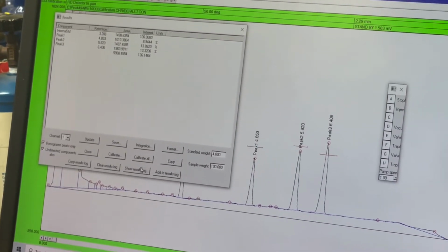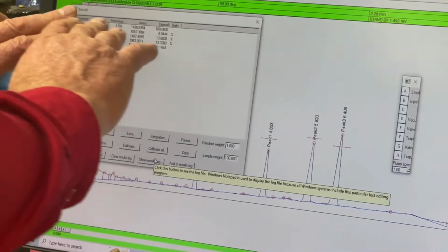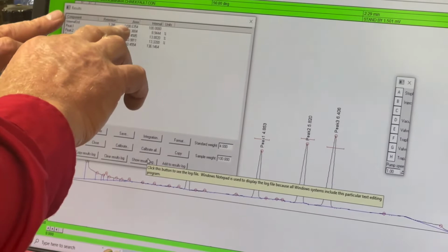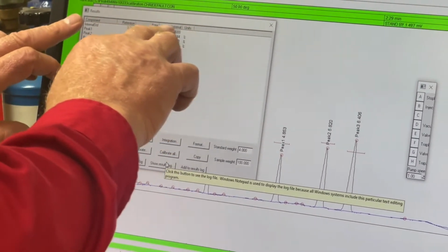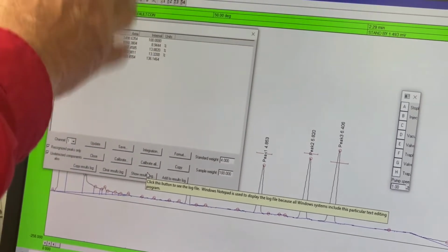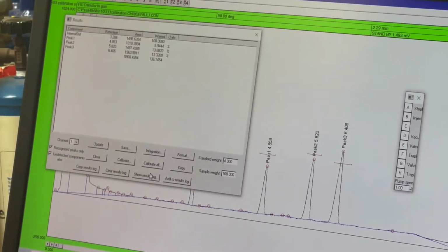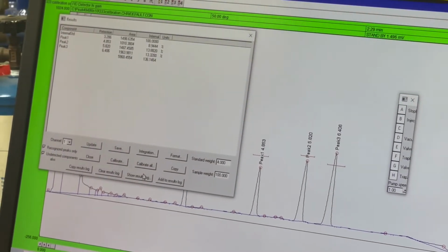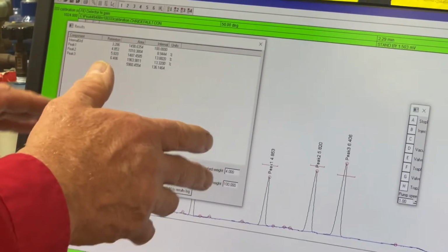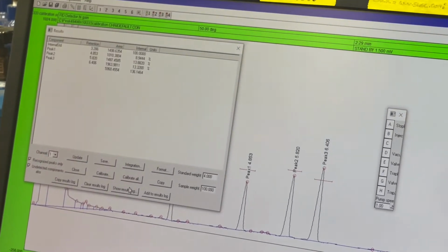So the log file takes this data and it stretches it out into one long line. So the log file then accumulates, so you get this chromatogram in the first line and then the next chromatogram in the next line. And the beauty of this is it's ready for export to Excel because all the columns are already lined up. So it's a one-click thing to get a lot of data out of PeakSimple and into Excel. So that's what we're going to do.